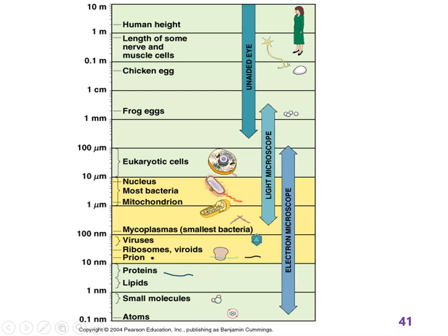microscopy, right. So what I want you to know about microscopy is its limitations and the major different types of microscopy. So what can we use them for and what can we not use them for? And what are they? So here's kind of the challenge we have.